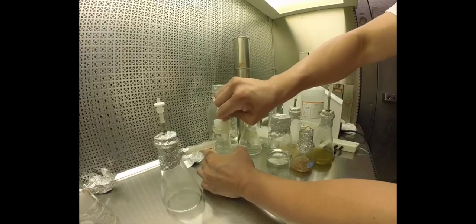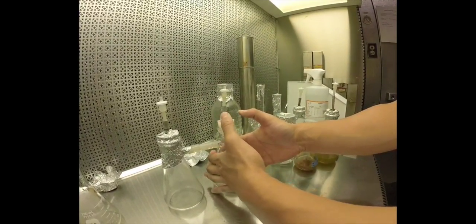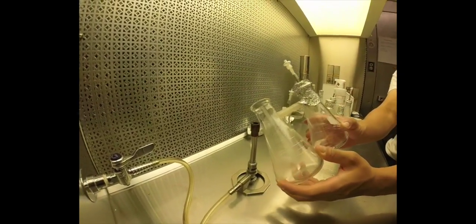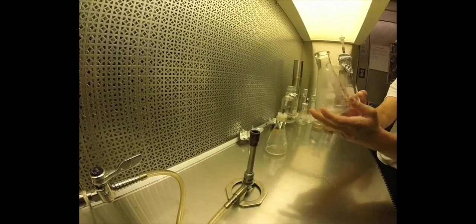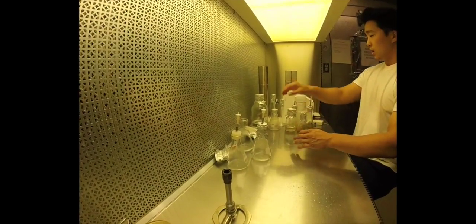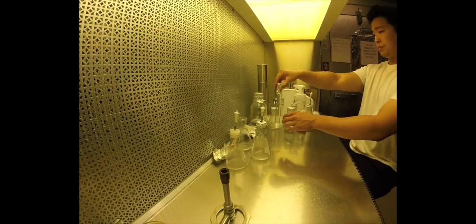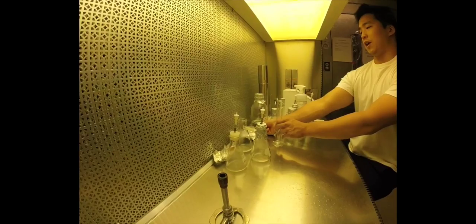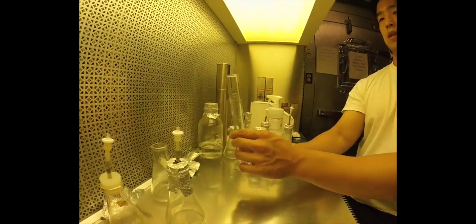And after some finagling, if that doesn't work, you can put your thumbs on the edge of the stopper and push, and that'll do it. And we can flame this one off. And of course, be careful about the tubing. So what we can do is transfer 50 mLs of the half-X 1/8 ammonium WFAM into this one. So flame this one off.